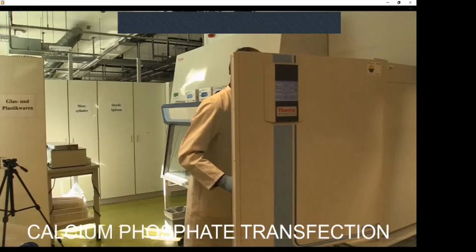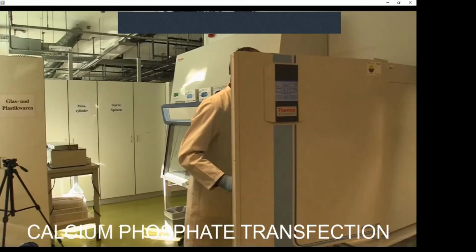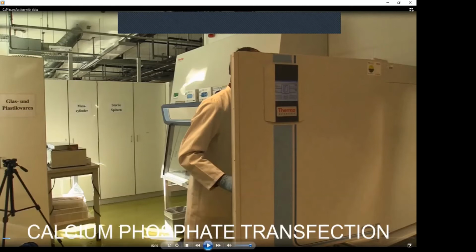That means that for each cell type, cell line, one has to test the number of cells in pilot experiments. For these MEFs, we have tested it before, and this was this number, 150,000. Then cells were seeded in the full medium, which contains both FCS and also penstrep, which is the penicillin streptomycin antibiotics.